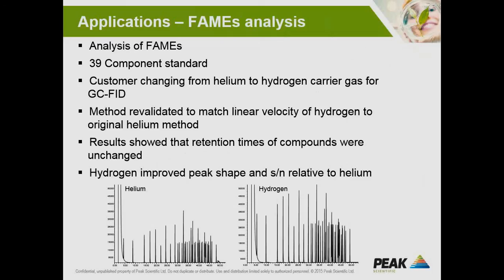As you can see from the two chromatograms at the bottom, the retention times are unchanged, but the advantage is that the efficiency is improved when using hydrogen, so the peak shape's improved and there's a better signal to noise relative to helium.